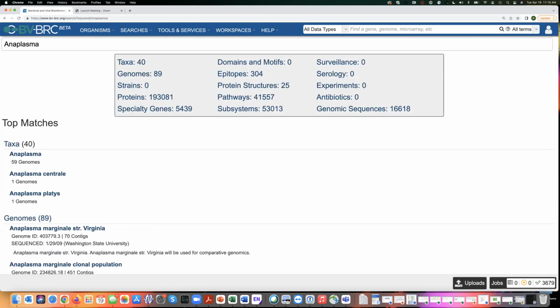Rebecca, can I interrupt with a question from an attendee? Their question is, when you were looking at the Coxiella genomes, they thought they noticed that 20 of the 21 were poor quality? Yes. What does that mean? Maybe you can expand on that.